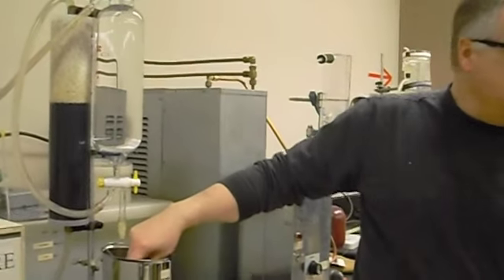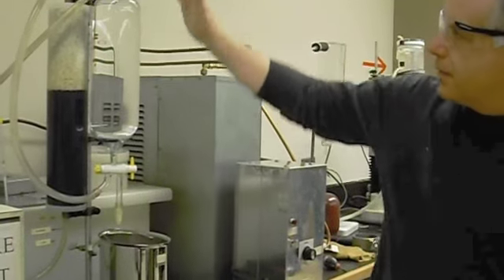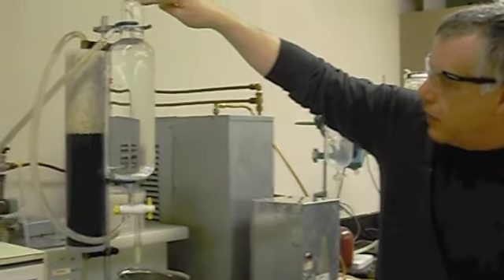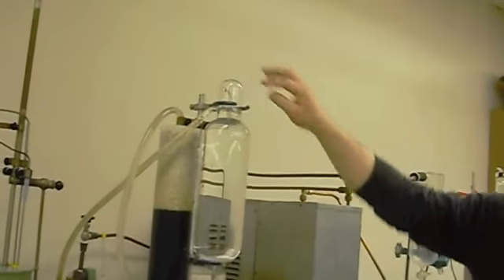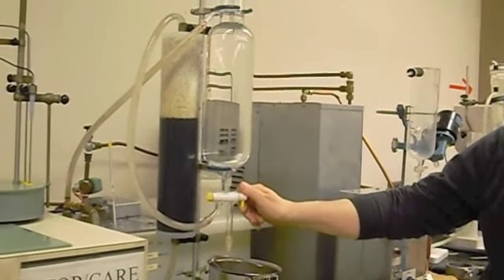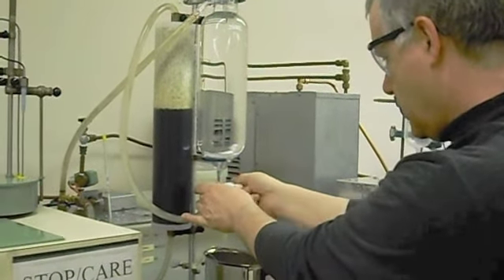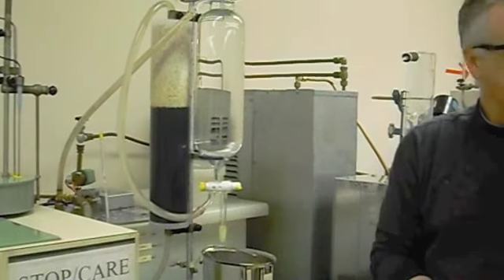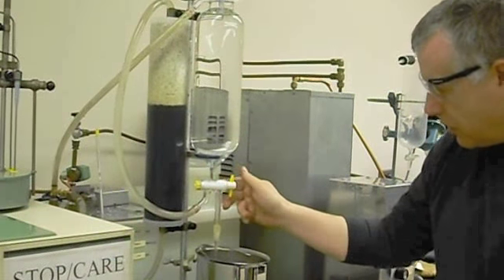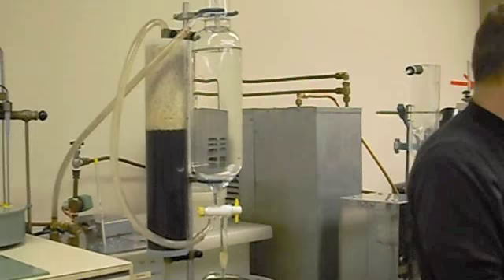Got the bomb loaded in here. Now I'm gonna charge it with water from here. So you notice there's water just constantly flowing into this and out the top, right? There's a little spout at the top. So first thing I'm gonna do is I'm gonna turn it clockwise. Oops, it's pretty sticky. To 90. And then I'm going to turn it another 90 degrees clockwise. And now it's just going to dump everything it has in that zone.